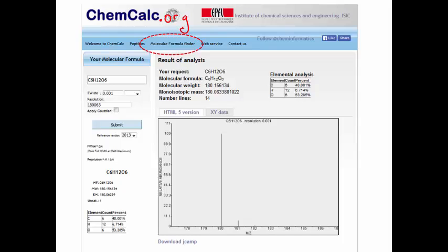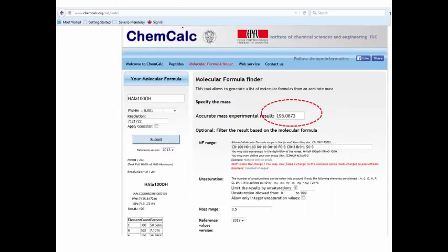You'll want to click this Molecular Formula Finder tool, and that'll bring you to this page here. And essentially what you need to do is enter the mass that you've observed from the time of flight, so not the mass that we know the compound is, because we don't know our compound. So you enter what's observed, and you can confine the elements if you happen to know what elements were in there, but we'll just leave this wide open and see what we get.